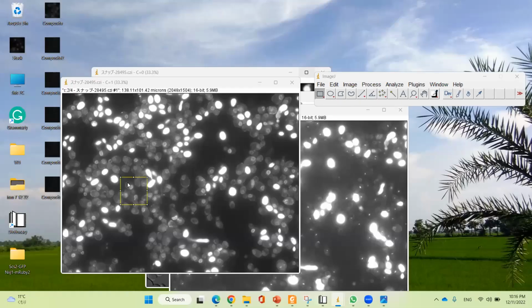So I have selected a portion, and the portion must be square in size. I am going to copy the selection information so that all the images that I cut ensure the same ratio.